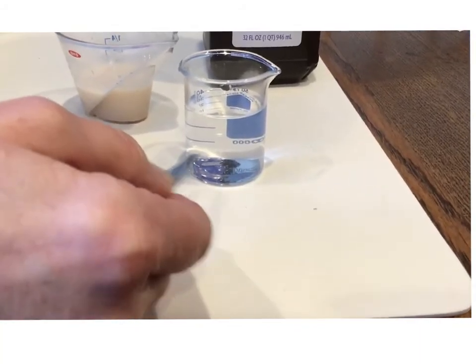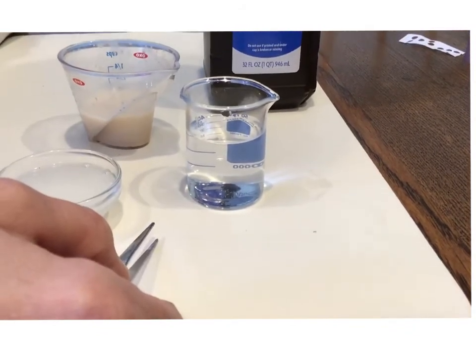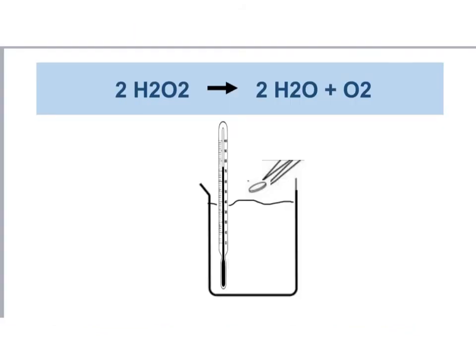And we're going to be testing temperature with this by changing the temperature of the hydrogen peroxide. So to clarify, the first thing that the scientist would do would be to measure the temperature of the hydrogen peroxide that had been placed in the beaker. They would use a pair of forceps to take a paper disc and soak it in yeast and be ready to start timing. As soon as the paper disc was dropped, time would start.